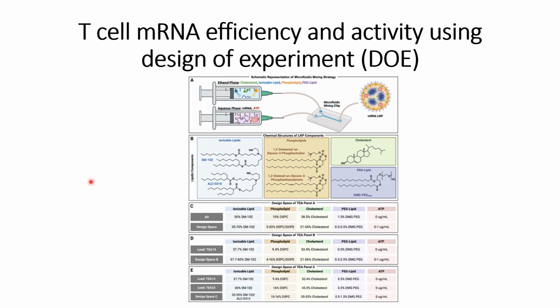for the different conditions. So they finally came to the understanding that the lipid nanoparticles, using the compositions they have used, will come close to 100 nanometers, which is sufficient for transfection into the cells.